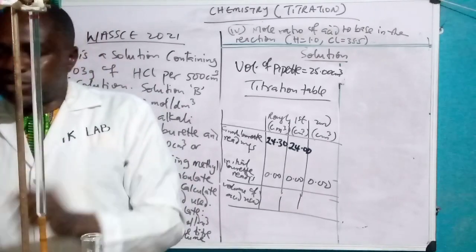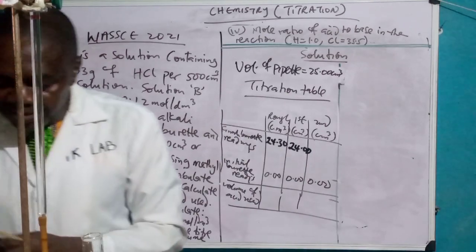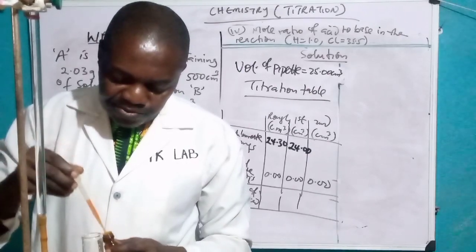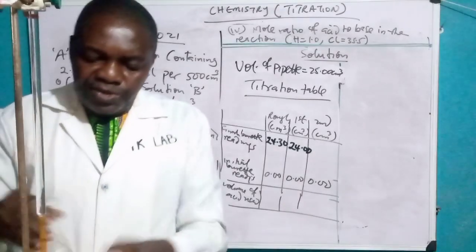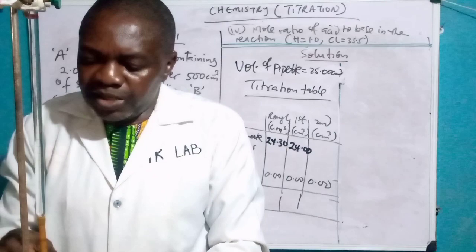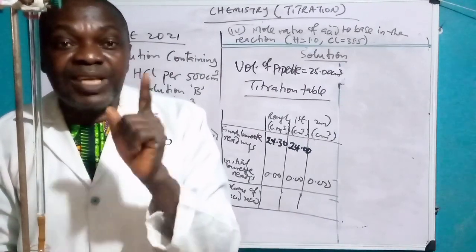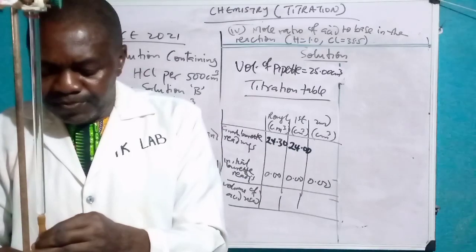As usual, there's still 1 drop. So we carry out the titration, the last one, before we start the calculation. Don't be too slow because you just have 2 hours for the whole work. You see it again, the solution is yellow in color. Then we start the work. Whenever we still add acid, I will fill it. If there's no acid again, check my first video, see how to calculate it, where you start from, and how to write your values.